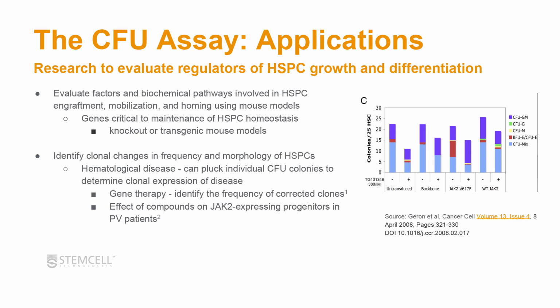So just to summarize then, the CFU assay has been used to identify the potency and the quality of hematopoietic stem cells.